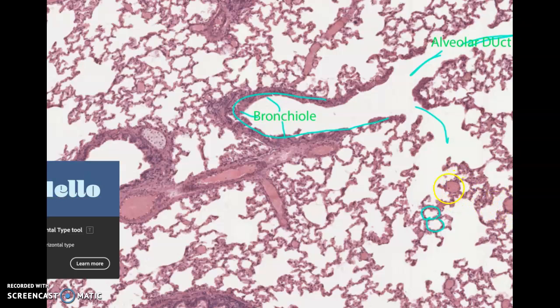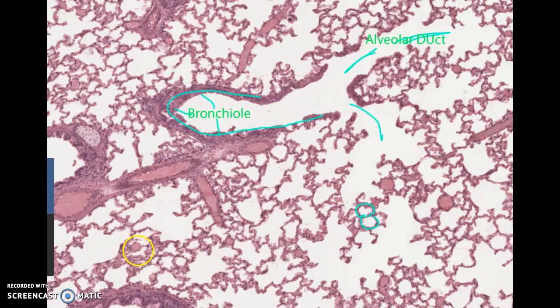This one's probably something called a venule. This one's something called an arteriole. So over here, that's actually a capillary probably. Looks very big for a capillary. So these would be blood vessels. So the alveolus is going to be clear on the inside. And I'm going to actually call them alveolar sacs for your labeling. So there and there, those would be the alveolar sacs.